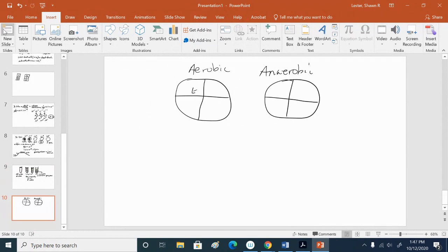And we had the same four bacteria: E. coli, Bacillus cereus, Micrococcus luteus, Clostridium sporogenes. And remember I said you ask yourself two questions. Where are the bacteria growing? Where are they growing better?